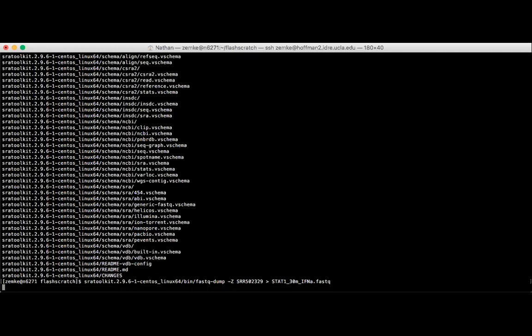I've noticed that this is prone to having errors. If it says that there was an error, you can stop it with, I think, either Control Z or Control X, and just do it again. Sometimes I have to do it 2 or 3 times before it works. I don't know why, but the connection gets interrupted a lot. If that happens, just try it again.